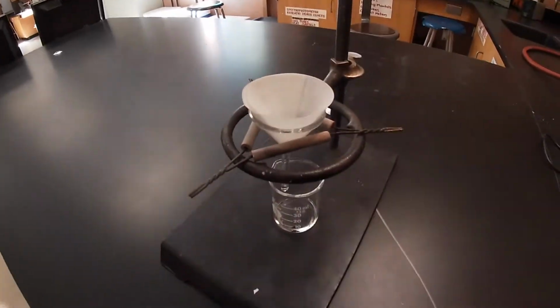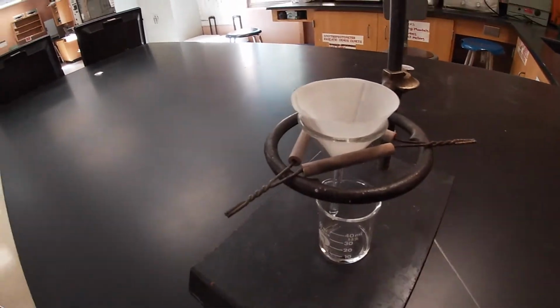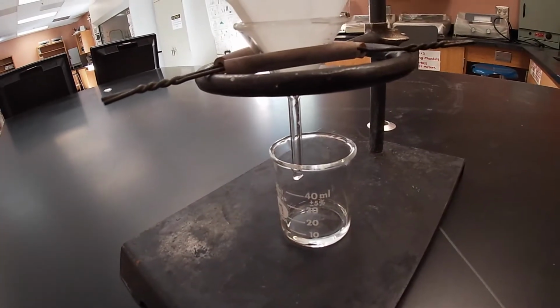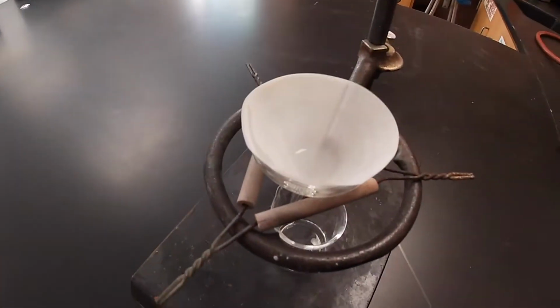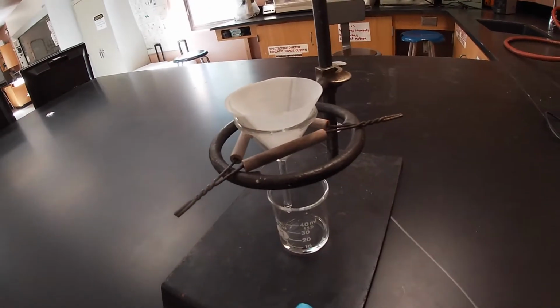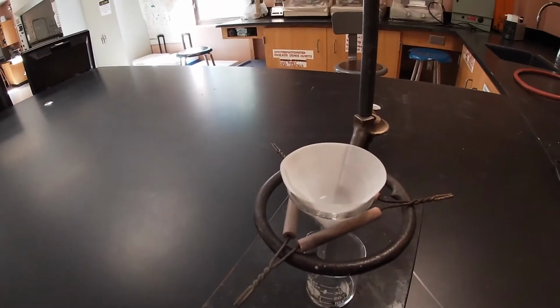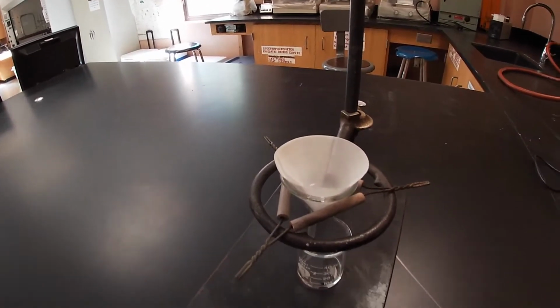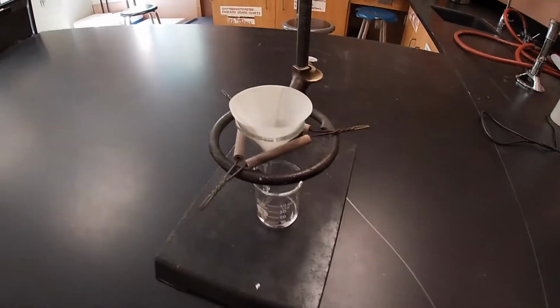And so here I use the triangle, and probably this is not the best way to do it, but it's doing the job. What we're gonna do now is just wait for that filtrate to go through, and then we'll test the contents of the filtrate, and then we'll also determine what was left behind in that filter paper. Okay, so this will be part C. We'll do all three tests again in just a second.